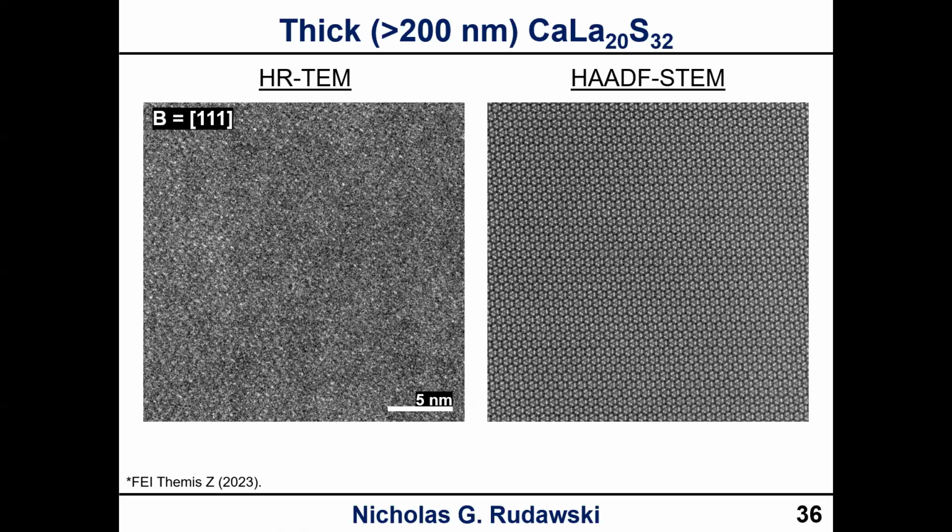Thank you, Nick. Next question just popped up from Satya Chaitanya Vadamanu. Based on your experience, are there any good STEM methods to differentiate carbides and steels? The different carbides I have showed similar DP and CBED patterns.